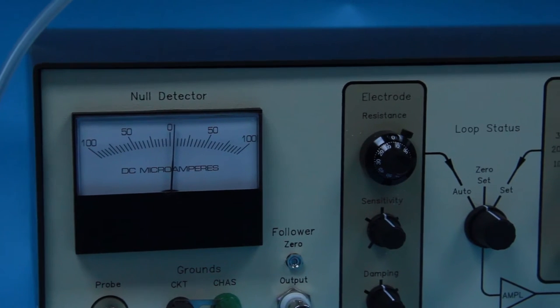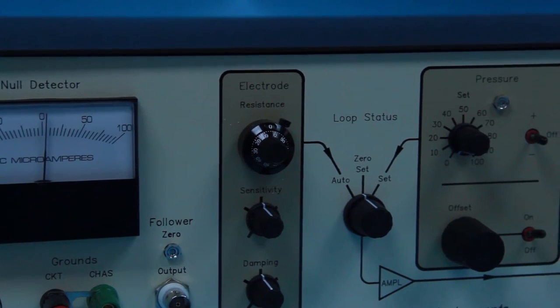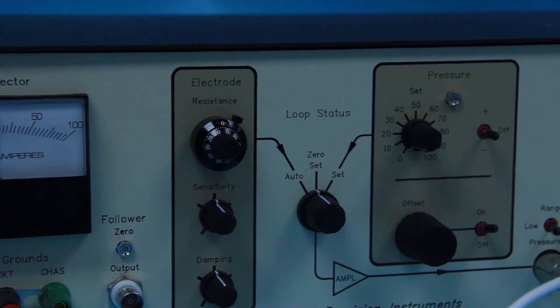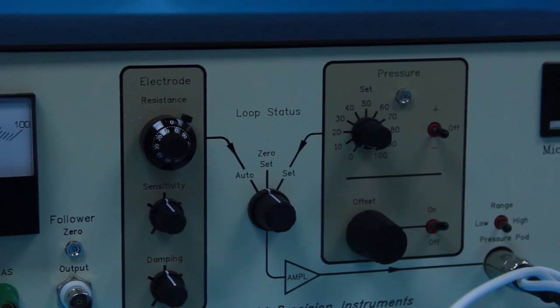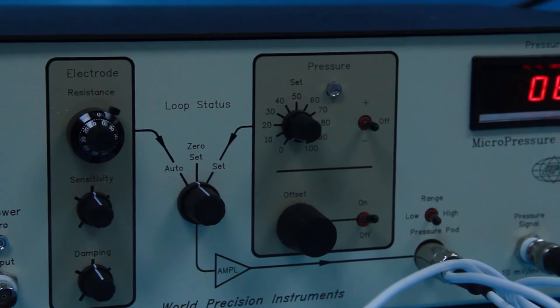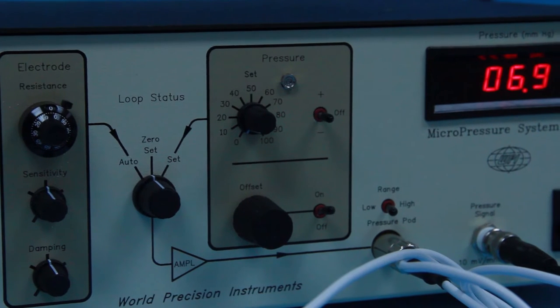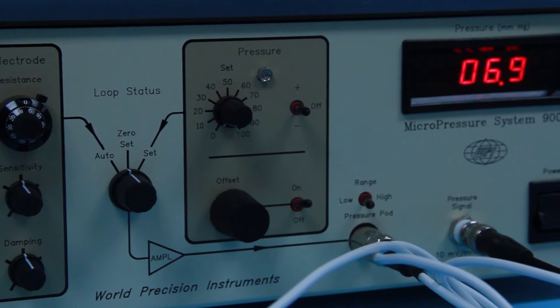The unique set pressure mode lets you preset the internal pressure of the microelectrode. Select a positive pressure for flushing the tip or a negative pressure for pulling solution into the tip. The 900A includes a built-in alarm sound to indicate maximum pressure. The alarm also sounds when the tip is blocked or electrical continuity is broken.